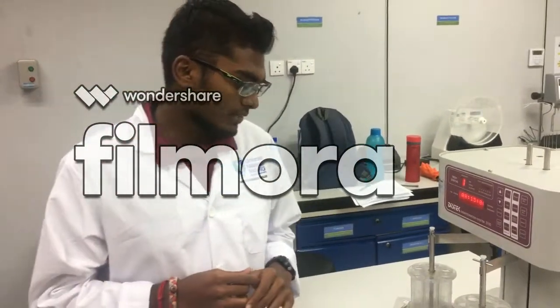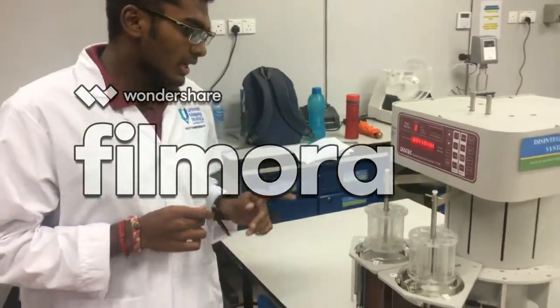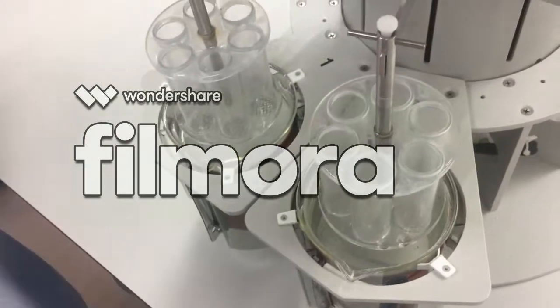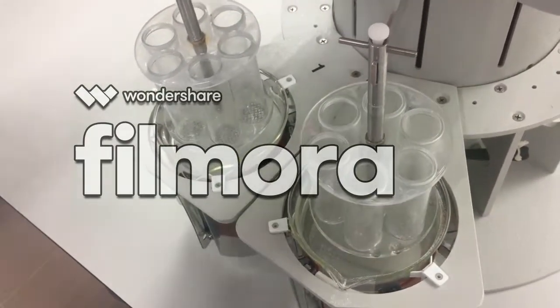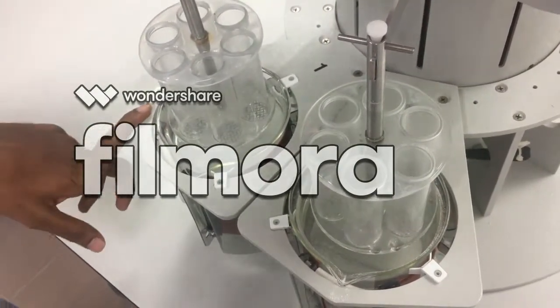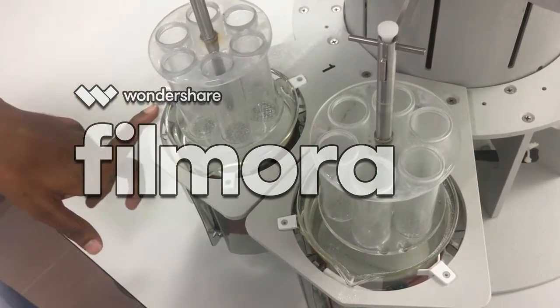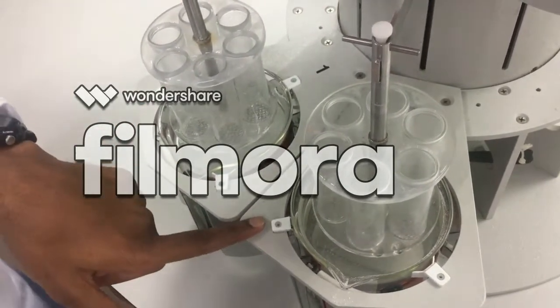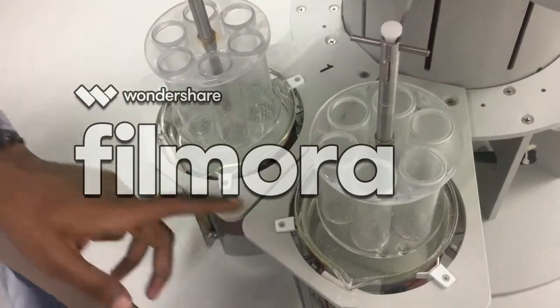But from what we have obtained, our result was that the uncoated tablet dissolved in less than 4 minutes, while the effervescent tablet dissolved in less than 3 minutes.